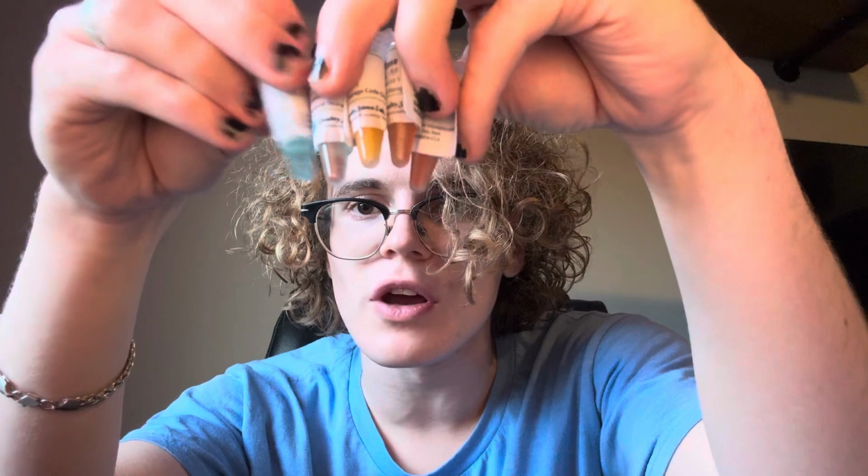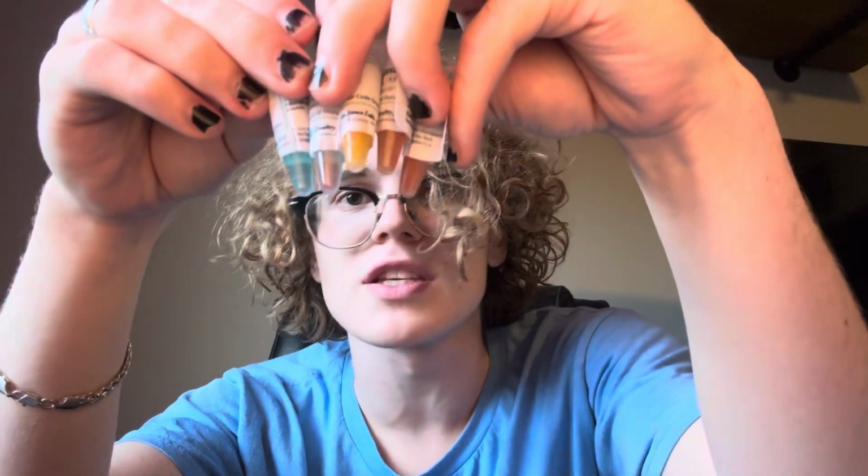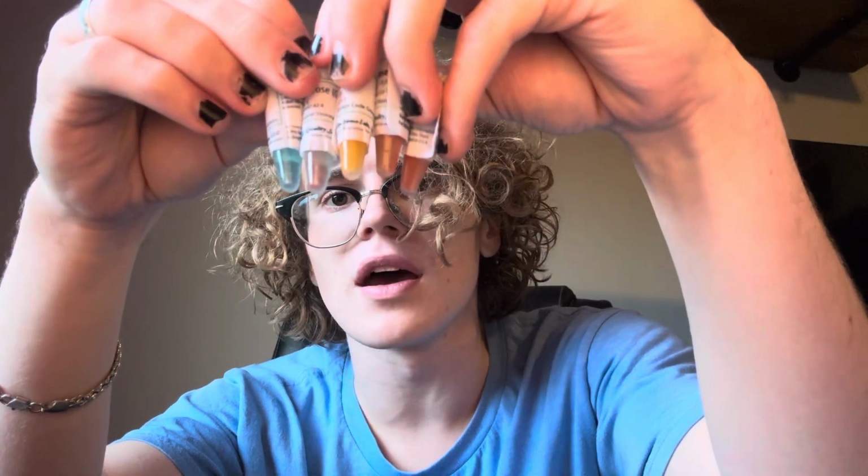And then of course over here on the right we've got, let's see, sucrose. As expected, sucrose would not be a reducing sugar, so we would see no reaction with the Benedict's reagent there. And of course we see it's still blue, still about the same color. I don't have the Benedict's reagent on hand, but of course you can look at your own if you'd like, I suppose.